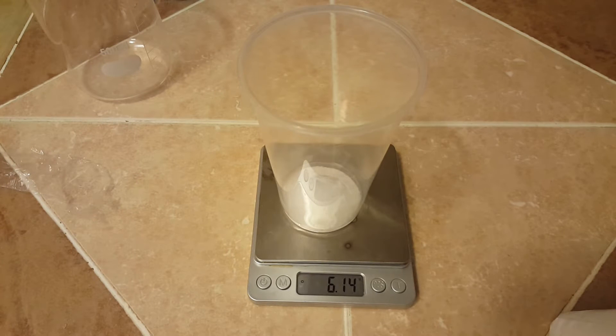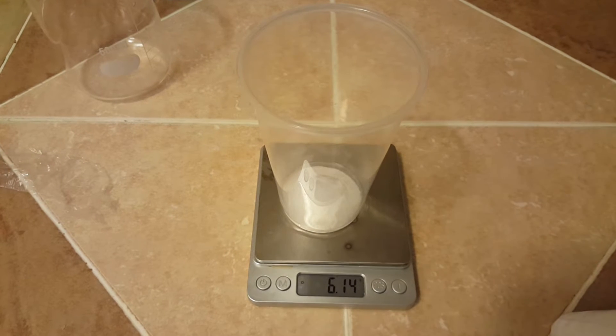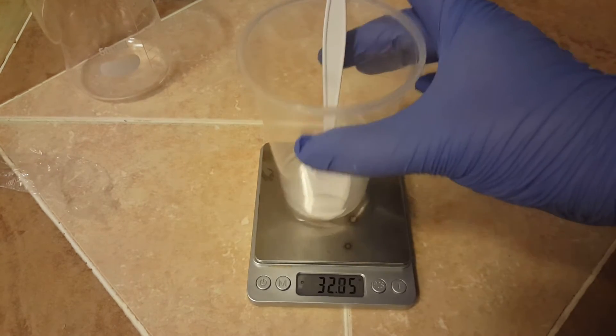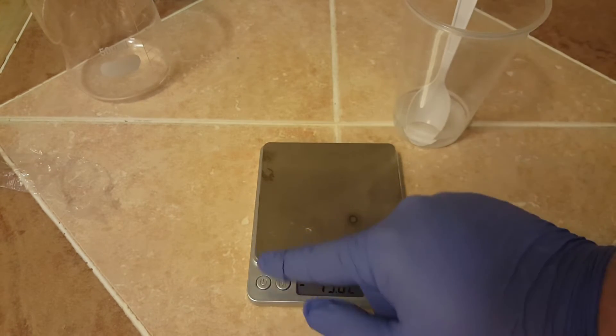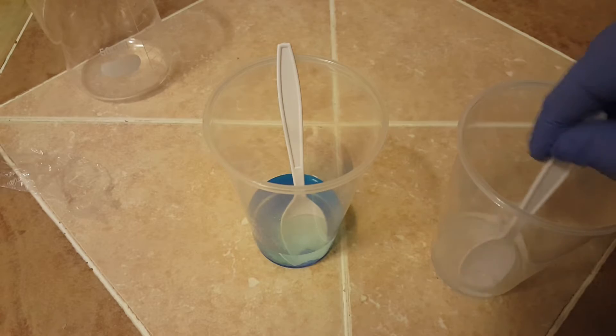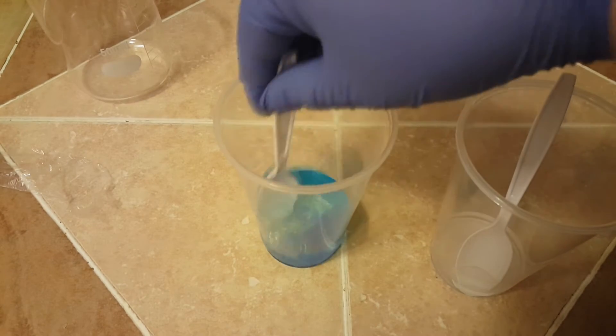Next you're going to want to measure out 6.14 grams of sodium metabisulfite. To this you're going to add about 32 grams of water and give both solutions a long time to dissolve. You can increase the rate at which these solids dissolve by stirring the solutions or using very hot water when you add them.